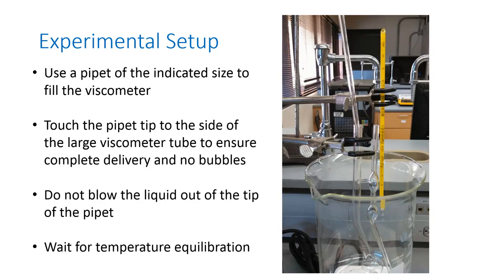Once you've filled the viscometer, you want to wait for a few minutes to make sure that the liquid inside is the same temperature as the water bath.